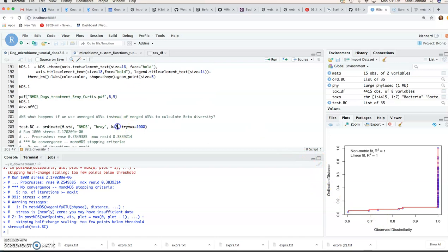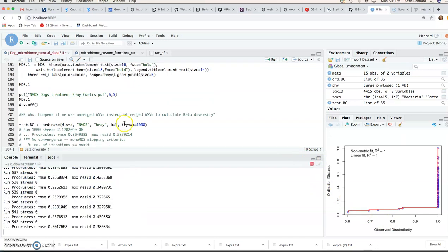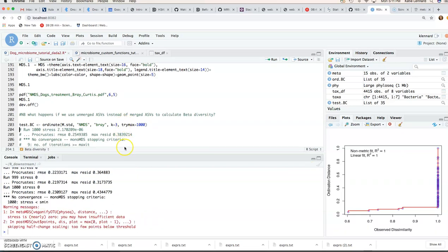So let's see what happens if we do K is equal to 3. So in this case we still don't get any convergence.